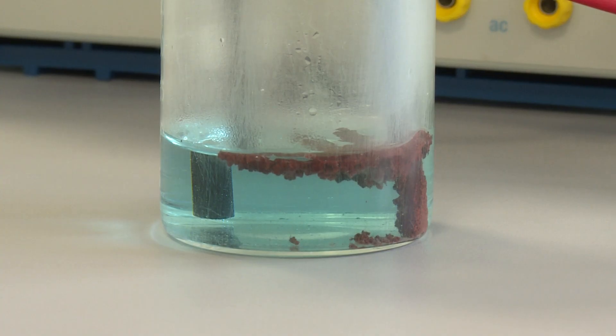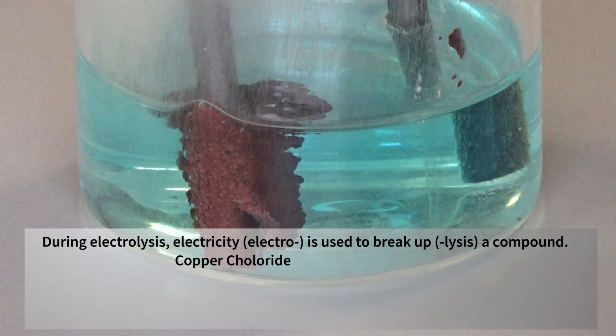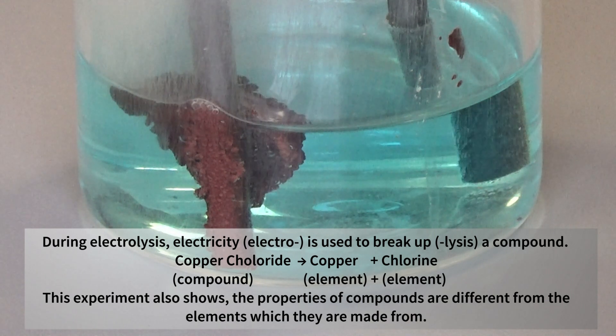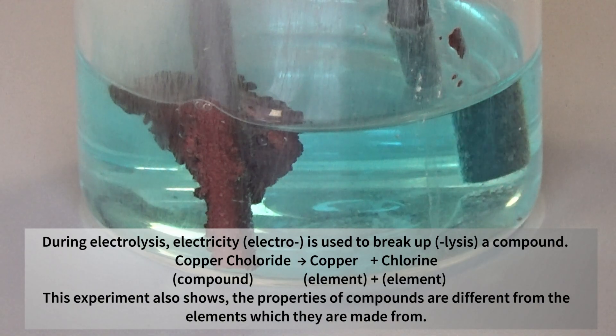At the negative electrode we have got this solid formed, and the solid formed is copper. The copper ions from solution — the positive copper ions — have been attracted to the negative electrode where they've gained electrons to form copper atoms. So copper has been formed.